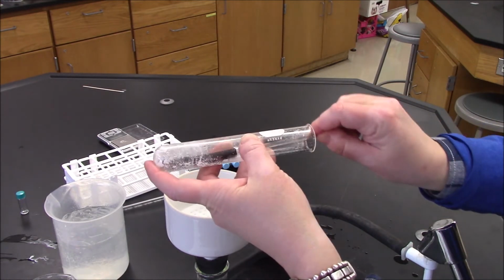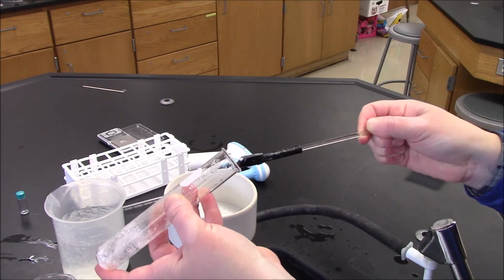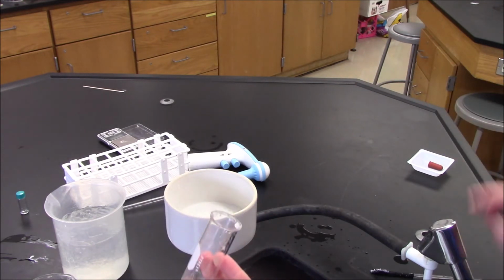If I can loosen this up now and maybe add a significant amount of water, I think I should be able to get most of this.